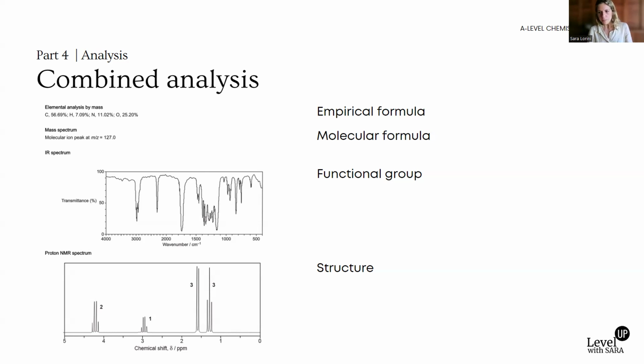And some peaks you are familiar with because they have a very distinctive shape. So just a little reminder here, for example, the alcohol has this broad peak at the very left-hand side of the spectrum. Or there are some others that are a little bit unfamiliar, like in this example, you have one around 2000. This is something that you don't really explain directly, but you have the data sheet.